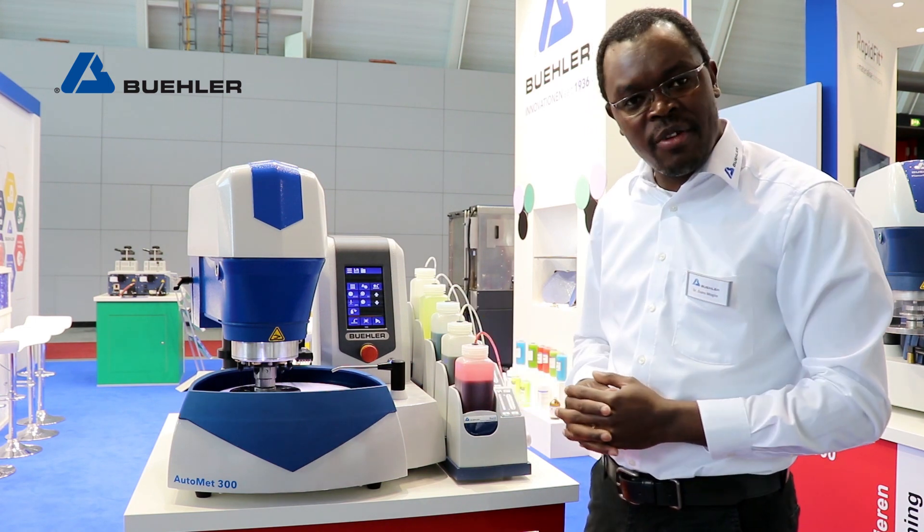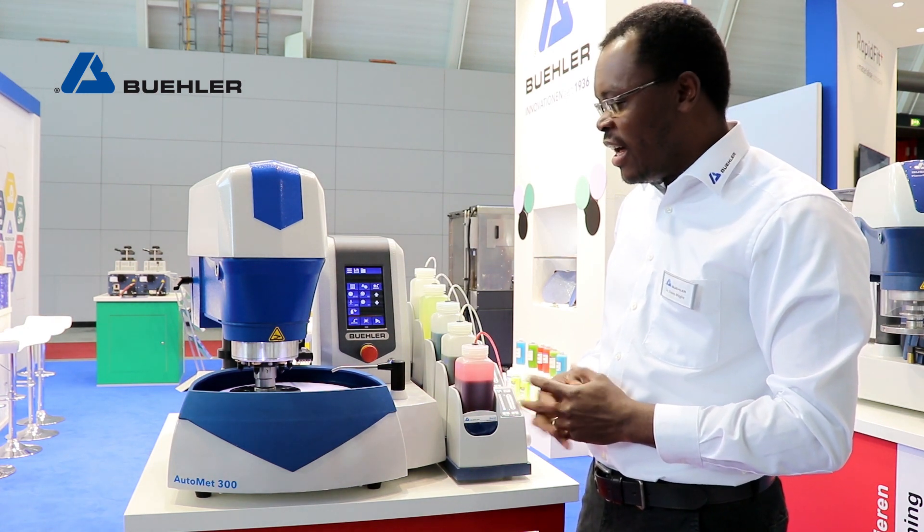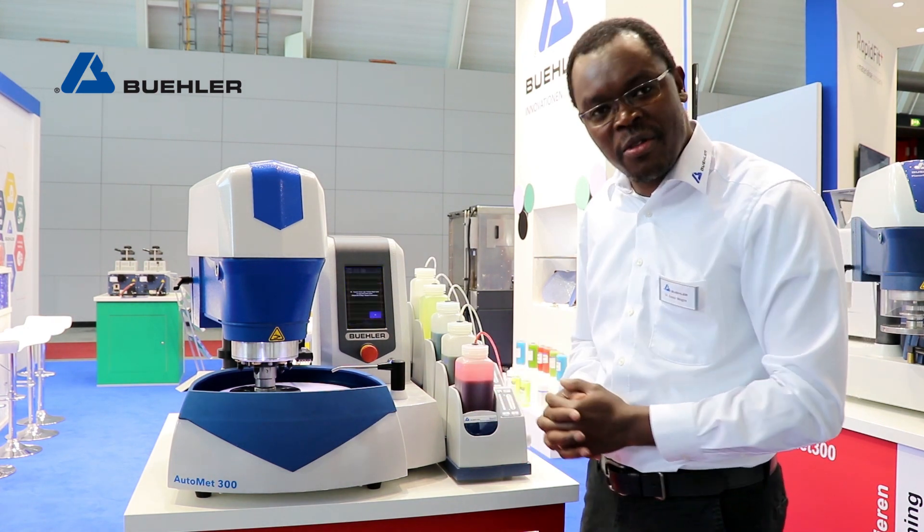I hope that gives you a quick overview of our AutoMet 300 machine. Looking forward to you going around the booth — thank you.